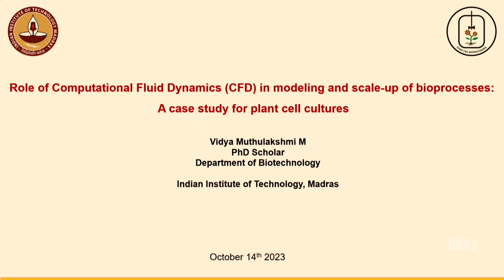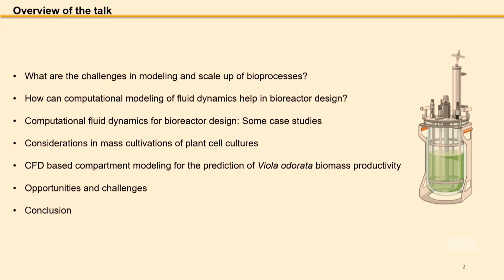Good afternoon. So today I'm going to talk about the role of computational fluid dynamics in modeling and the scale-up of bioprocesses, with a specific emphasis on plant cell cultures.